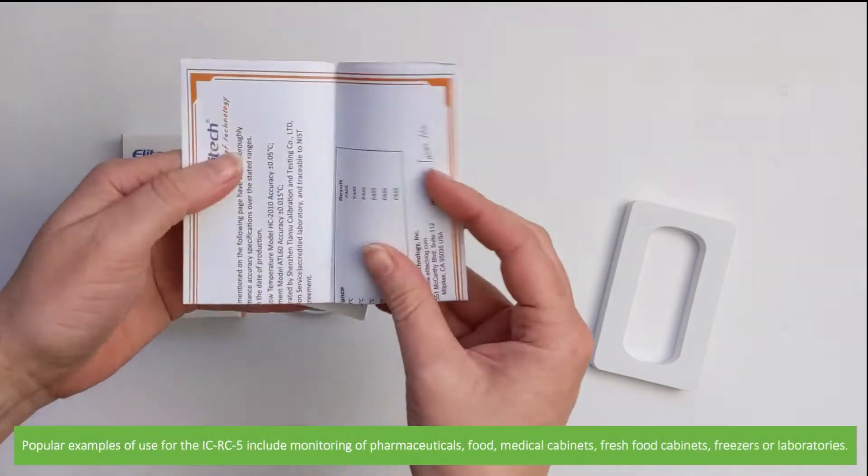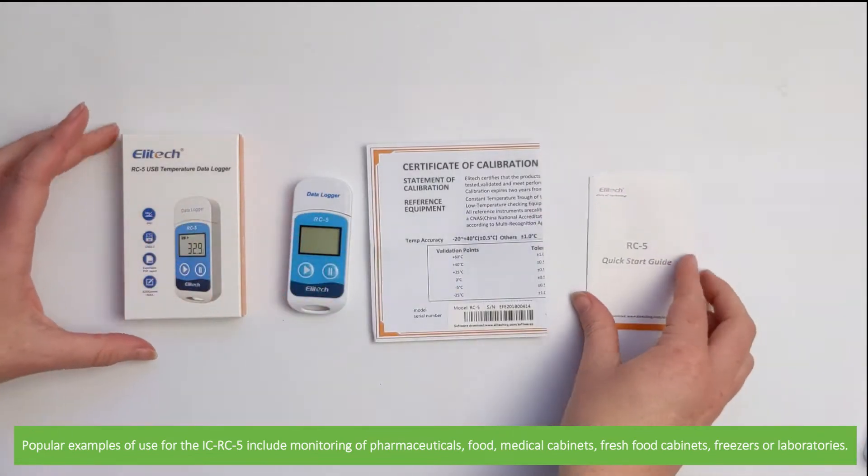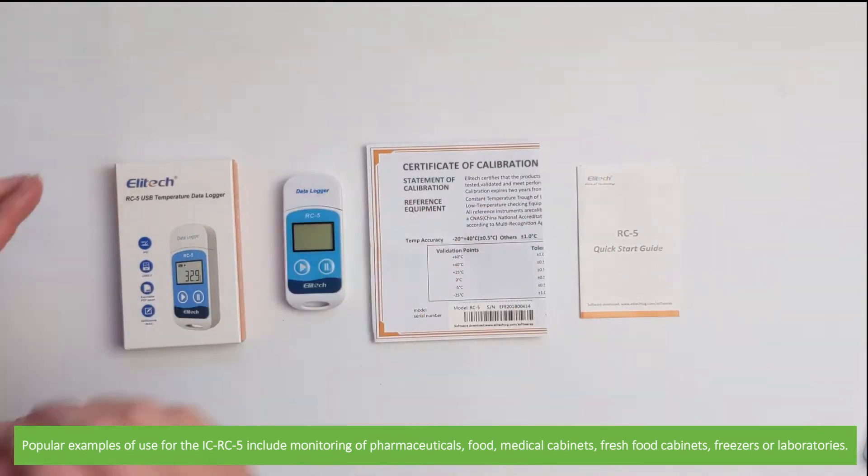Popular examples of use for the ICRC5 include monitoring of pharmaceuticals, food, medical cabinets, fresh food cabinets, freezers, or in laboratories.